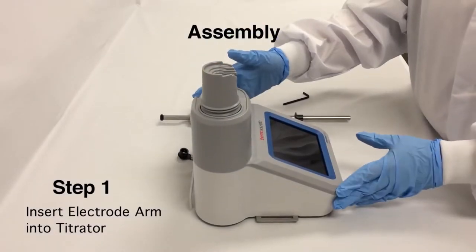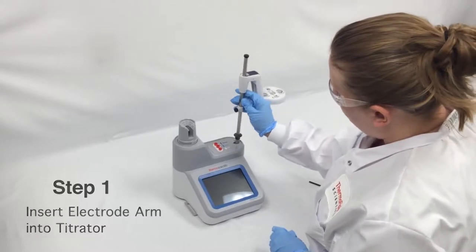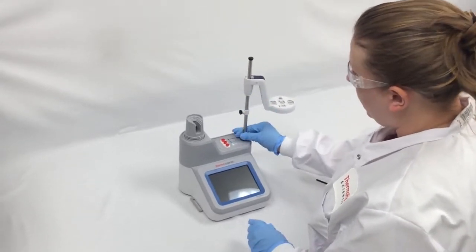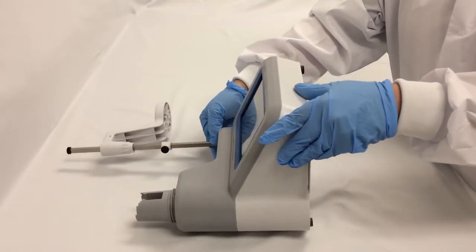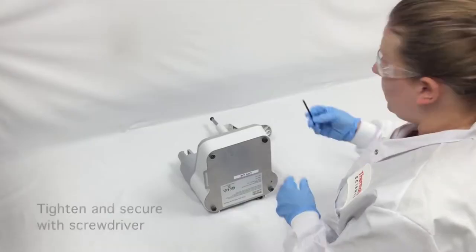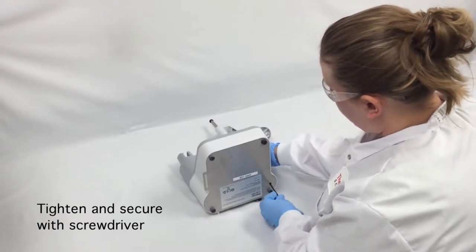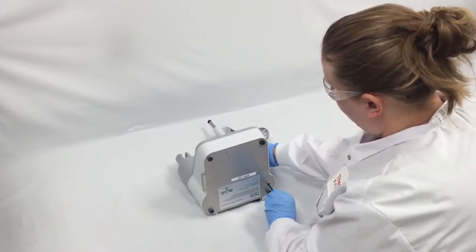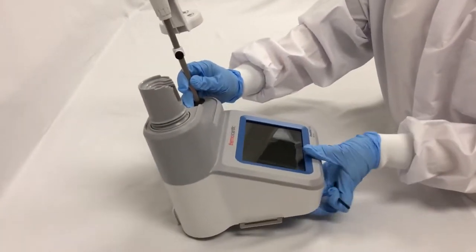The first step in our assembly process is we're going to take our electrode arm and insert it into the titrator, lining up the slats. I'm going to turn my titrator onto its side and use the included screwdriver to turn the captive screw in place until I feel it tighten. Now I know that my electrode arm is securely in place.